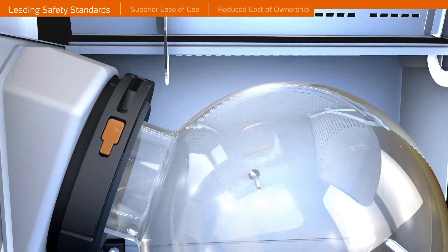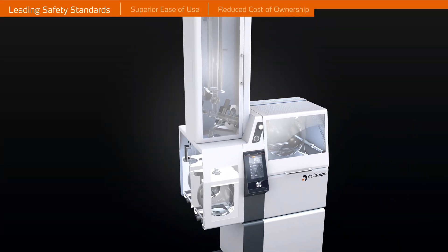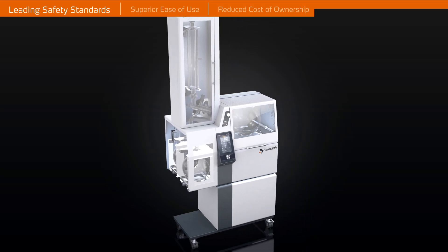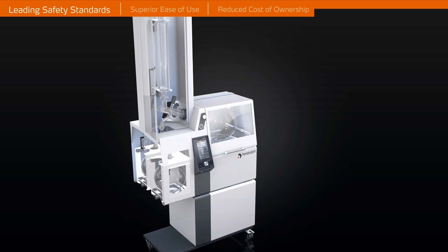All condenser glassware assemblies are contained inside a metal housing, equipped with a transparent high-impact PMMA door, providing industry-leading safety standards.